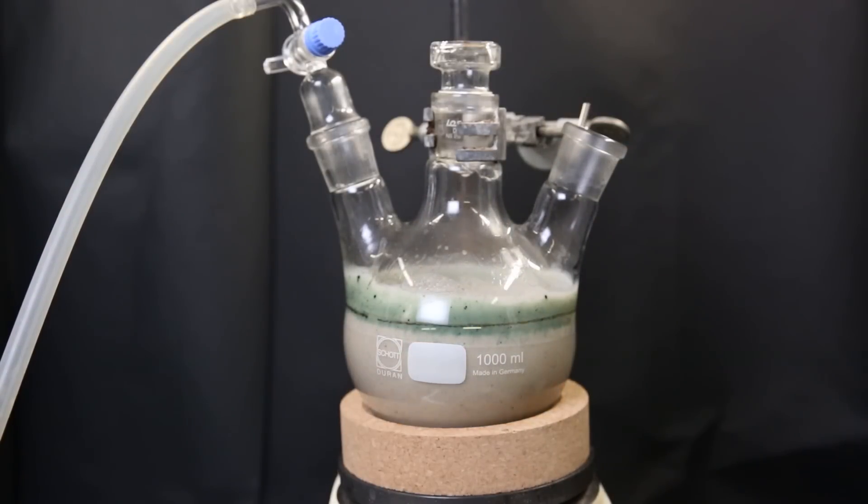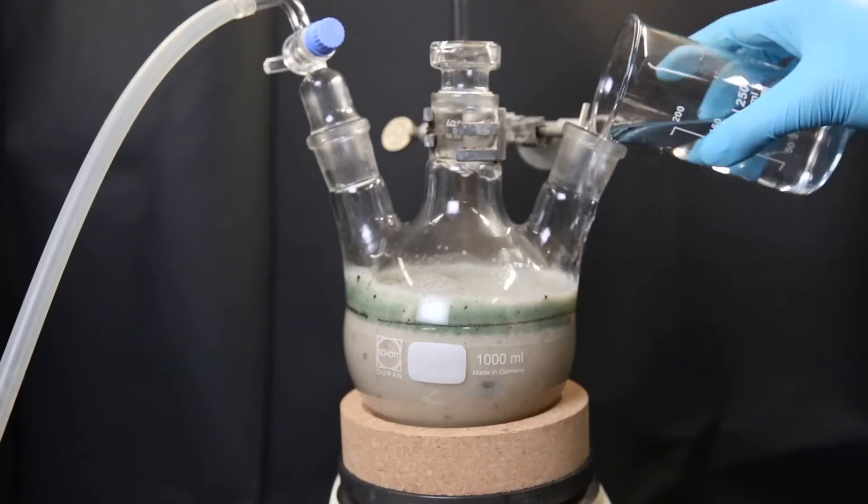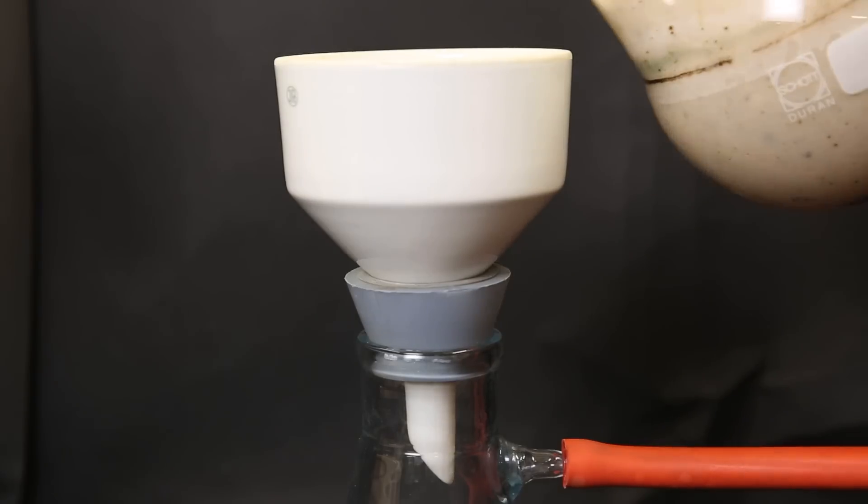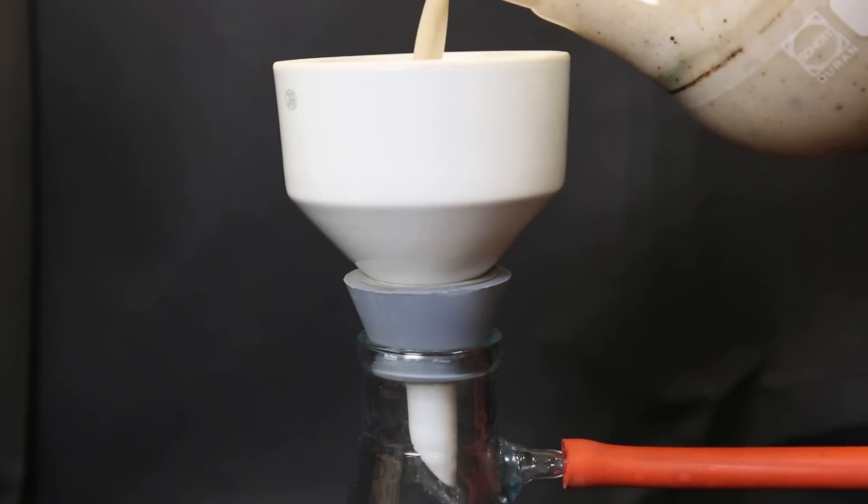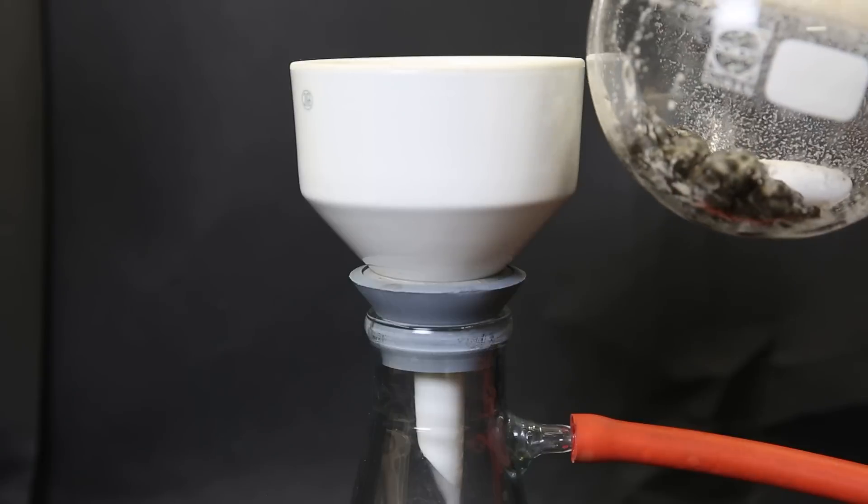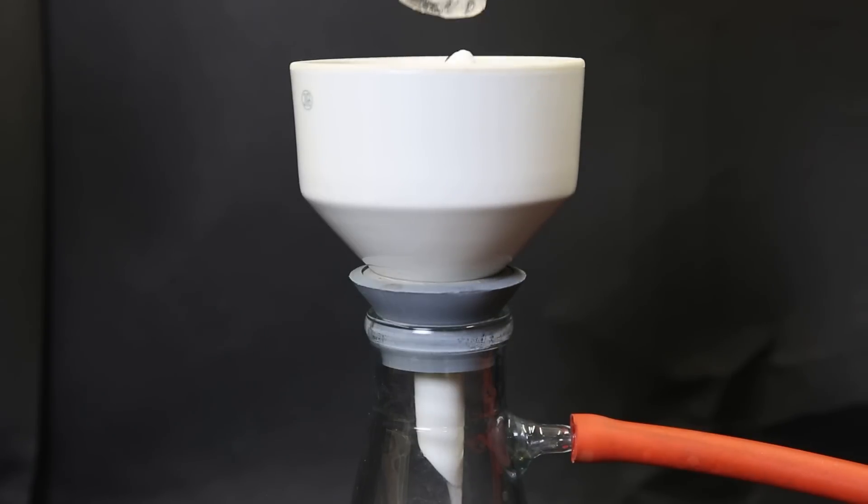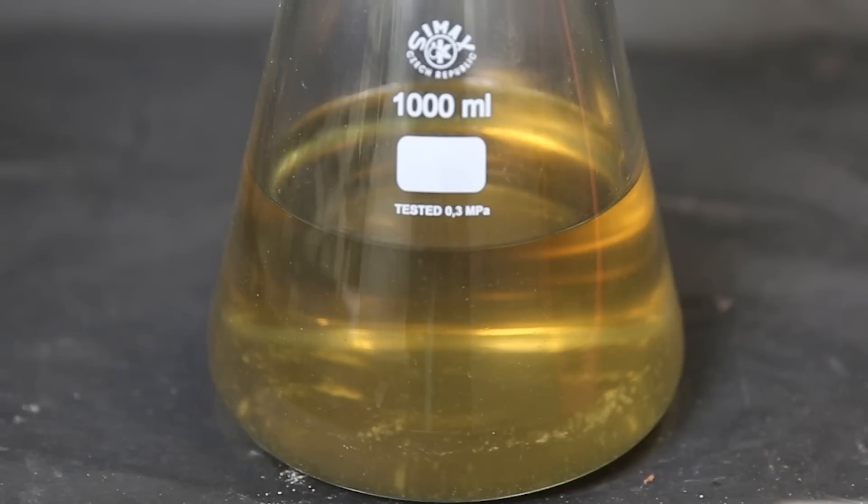I then leave it to stir for a bit, and when that is finished, I set it up for vacuum filtration. I simply filter it all through a paper filter and collect the residue. The filtrate is just a yellow-orange liquid and it's discarded.